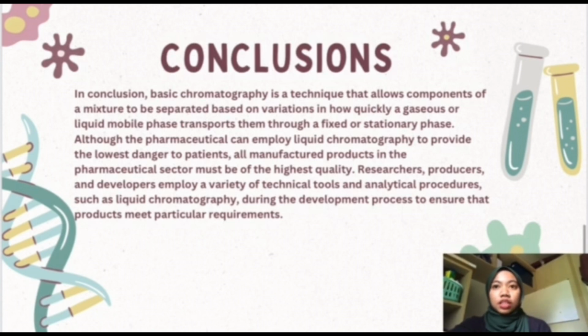The pharmaceutical industry can employ liquid chromatography to provide the lowest danger to the patient, as the manufactured product in the pharmaceutical sector must be of the highest quality. Researchers, producers, and developers employ a variety of technical tools and analytical procedures such as liquid chromatography during the development process to ensure that the product meets a particular requirement.